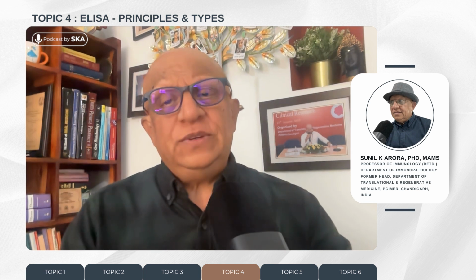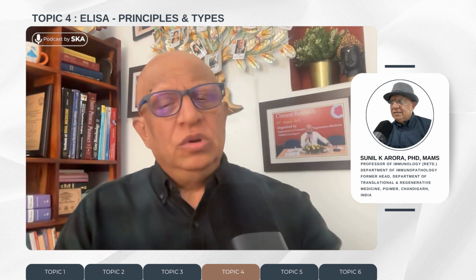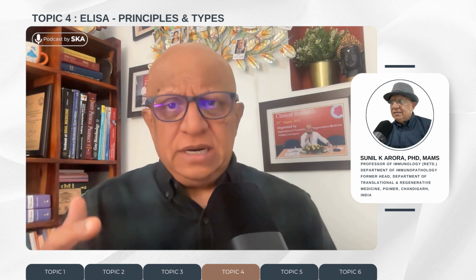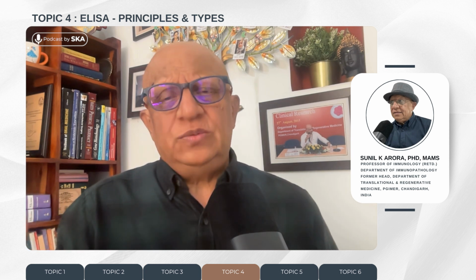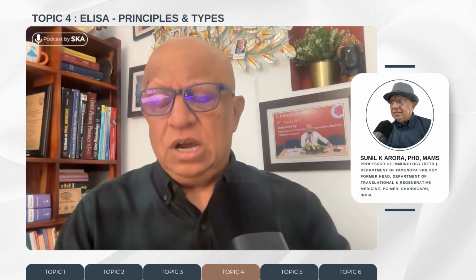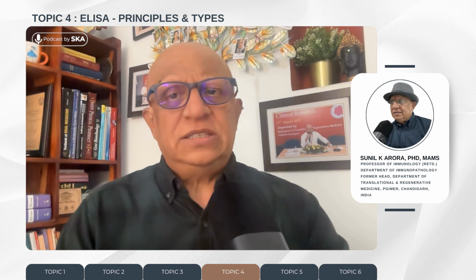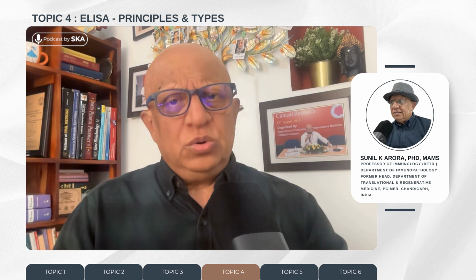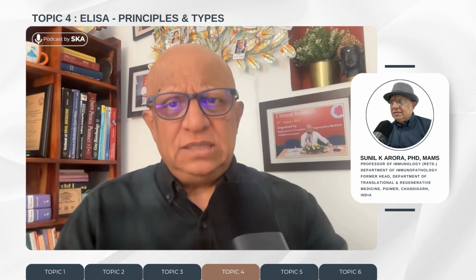The few points which need to be understood about ELISA, although nowadays we have sophisticated automated ELISA machines which will do the ELISA by robotic arms. They will add the reagents, washings, and everything is done inside, but they are very expensive. So in a simple laboratory, you can do ELISA yourself. I used to make my own ELISA, coat even the antigen myself.